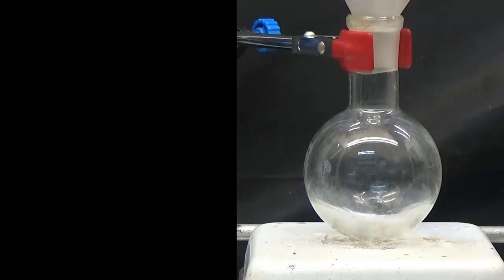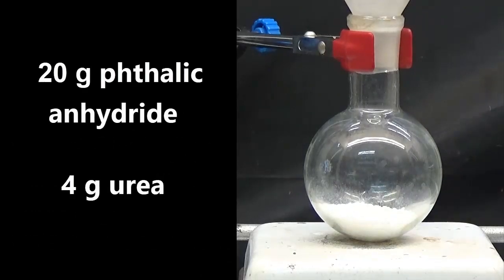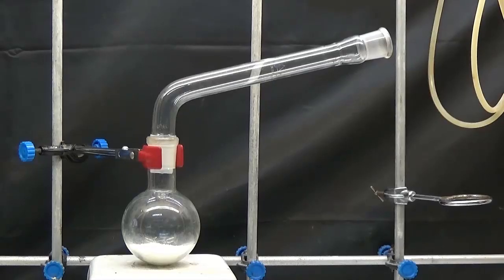To obtain phthalimide, place in a 250ml flask 20g of phthalic anhydride and 4g of urea. We attached a long tube to the flask to retain the sublimating phthalic anhydride.